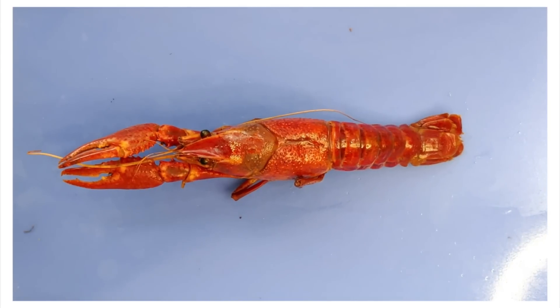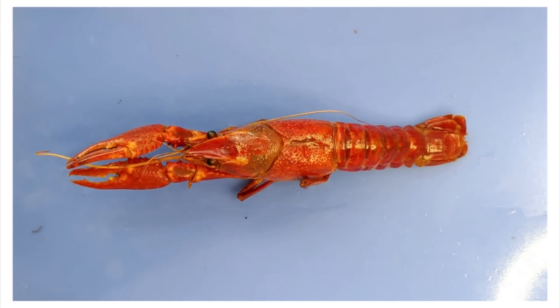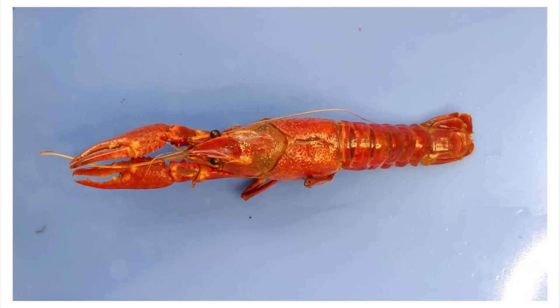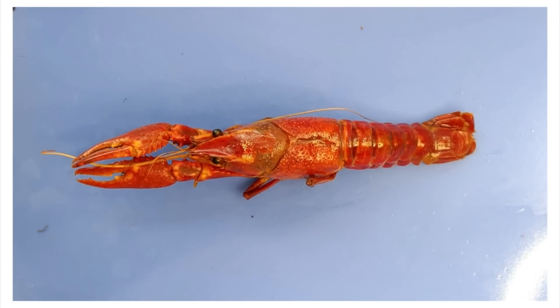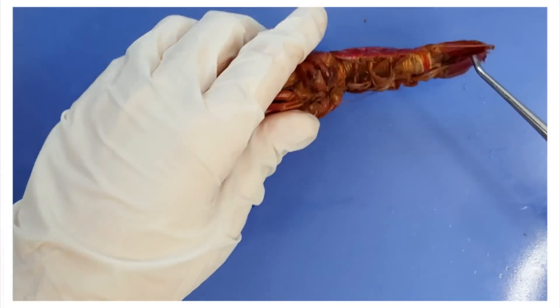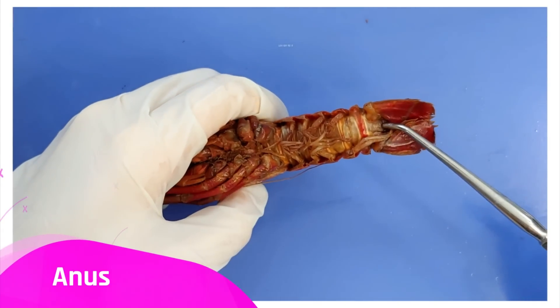The crayfish has a complete digestive tract, which means it has both a mouth and an anus and some complicated maneuvering inside its body to get from one to the other. The mouth is here at the front of its body, and the anus is here at the base of its tail.